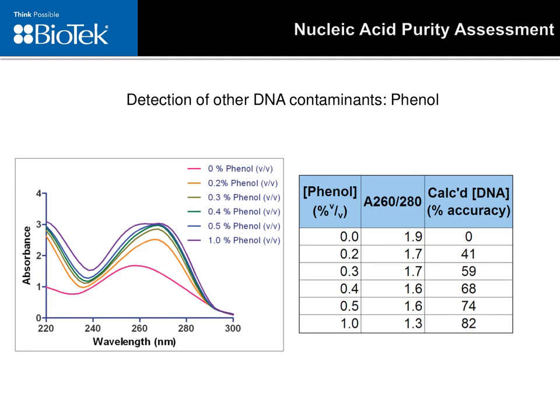They're half-area plates, which give that higher path length at the smaller volumes. There is an application note on our website which discusses the higher throughput method and has the part number for that plate from Greiner, and I'm sure there are others out there as well. It's just important to make sure that it's a UV-transparent plate if we're performing the absorbance in the UV range. For PicoGreen, you have more flexibility in the plate type that you use because it doesn't necessarily need to be UV transparent.